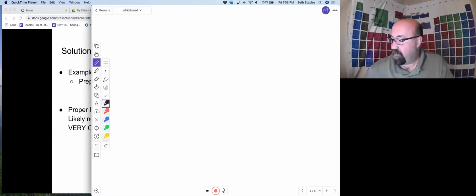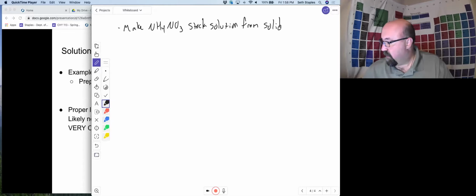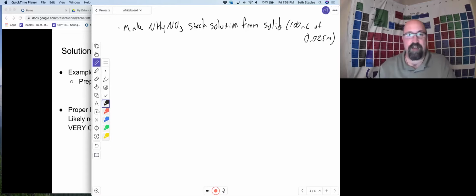And so if we outline the tasks that you need to do, you need to first make your NH4NO3 stock solution from the solid, and that is 100 milliliters of the 0.025 molar.